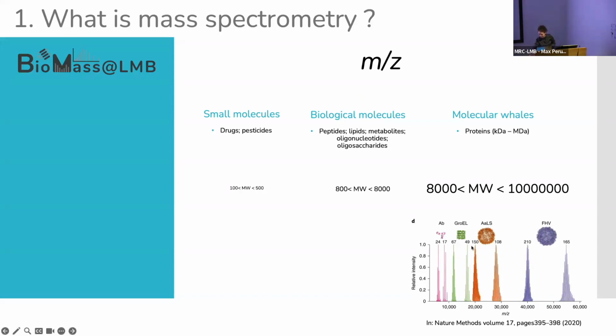And here you can actually see that the average charge distribution on a molecule like this is around 165 to 110, so you need to have a really high resolution, and in some situations you actually need to have a slightly different operating mass spec.